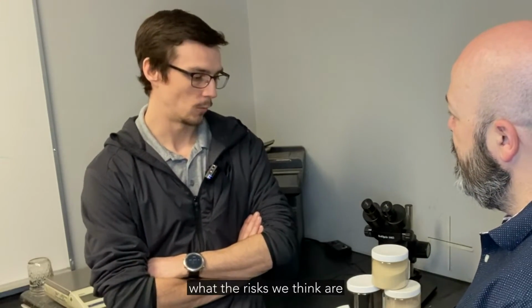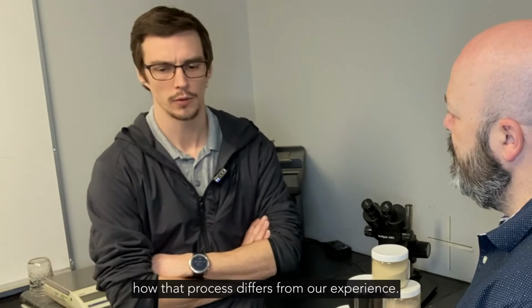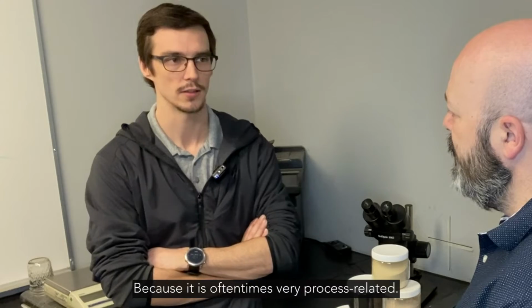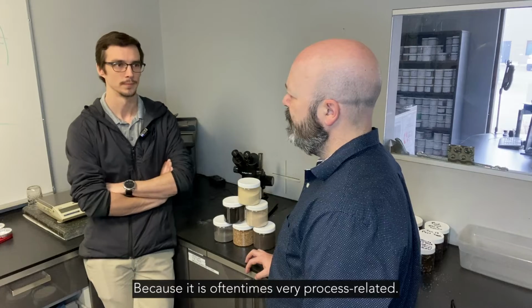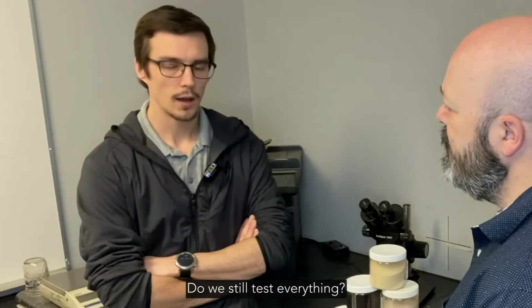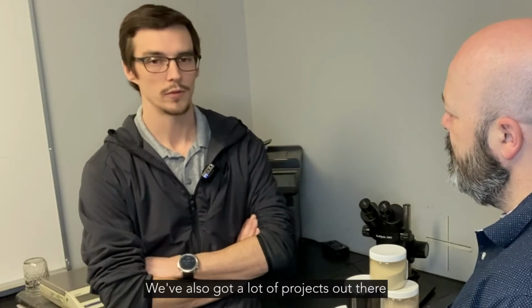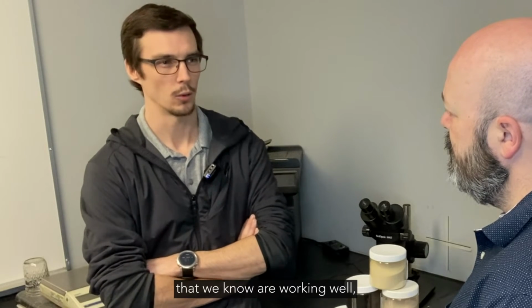It comes down to what the risks we think are and what our experience is with the product, and a lot of the times how the process differs from our experience, because it is oftentimes very process related. So we've been doing this for a long time. Do we still test everything? No, we've got a really good database of tests that we've done. We've also got a lot of projects out there that we know are working well.